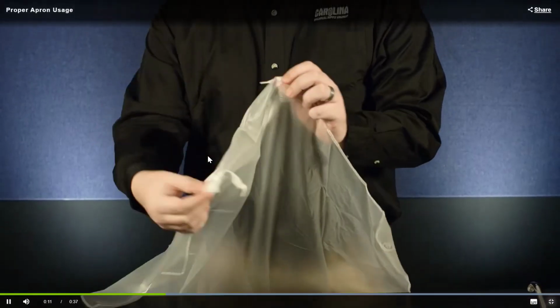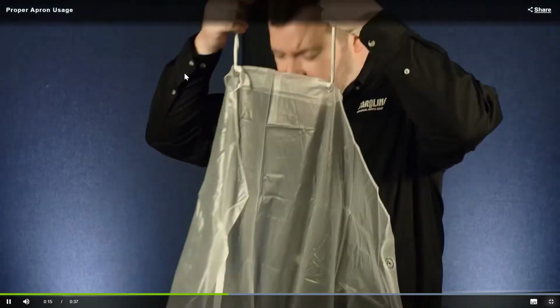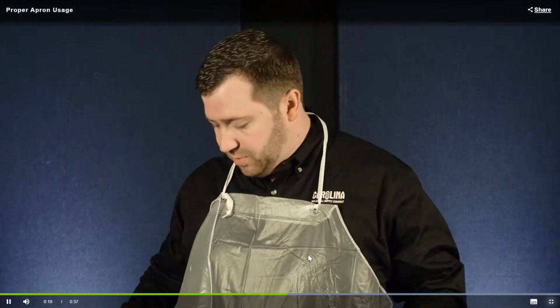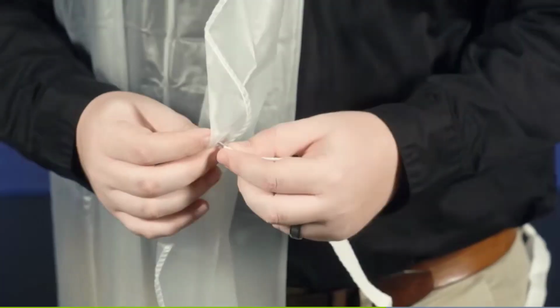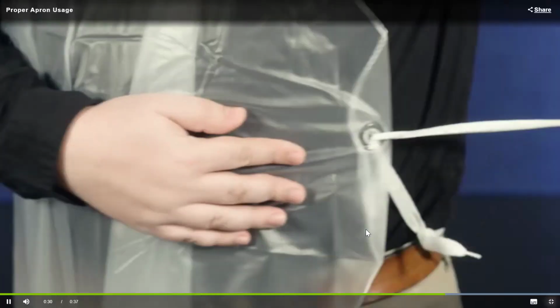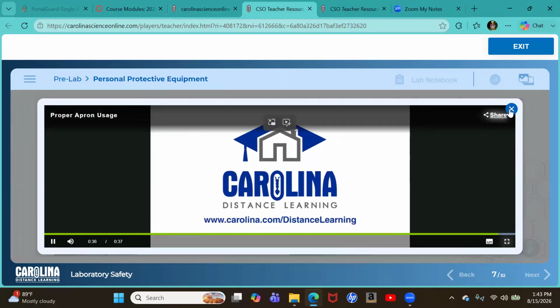Okay. So you see here, it is going to be a plastic apron and it's going to have this neck piece that will go over your neck and you're going to want to tie it at your back. This is to prevent any spills or drips getting on you and your clothing during the experiment. Please save the apron for all of your labs that we will be completing in this course.